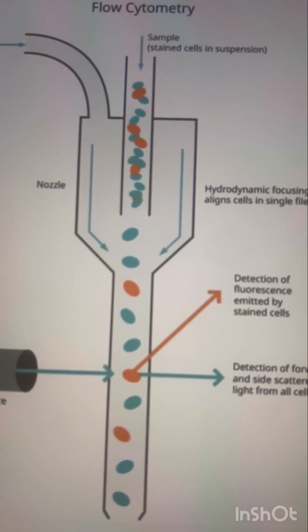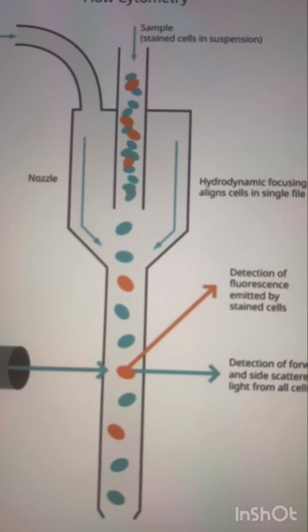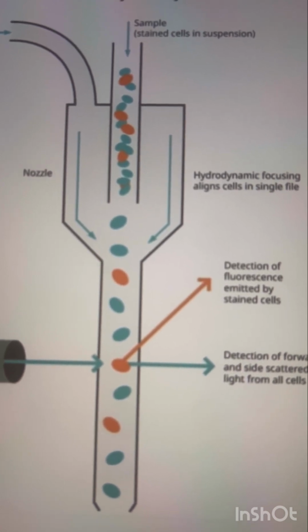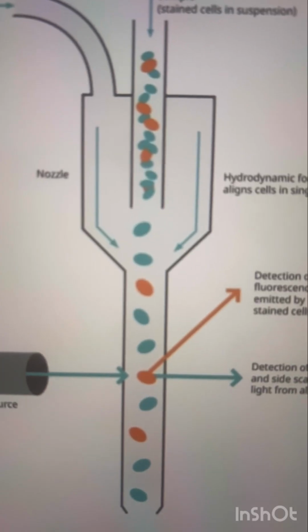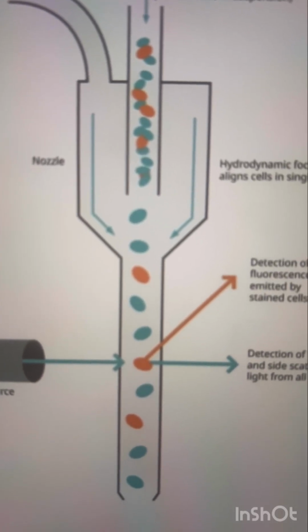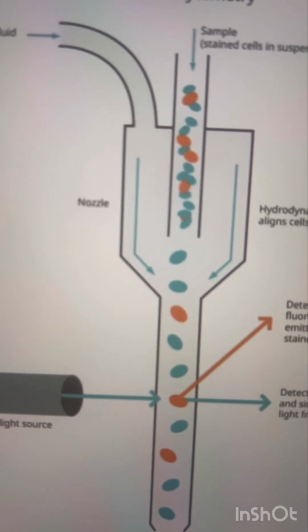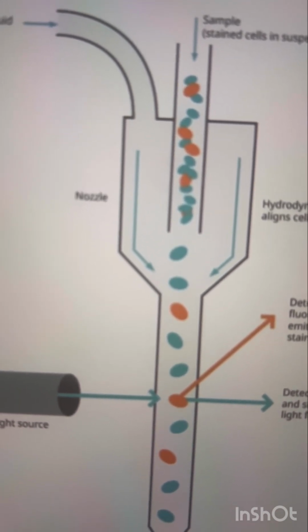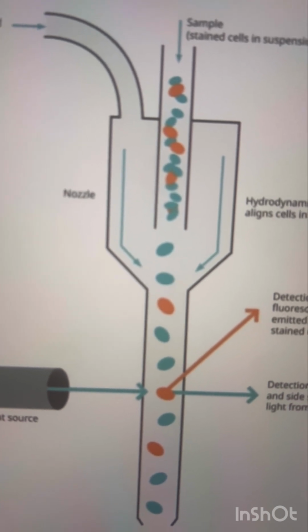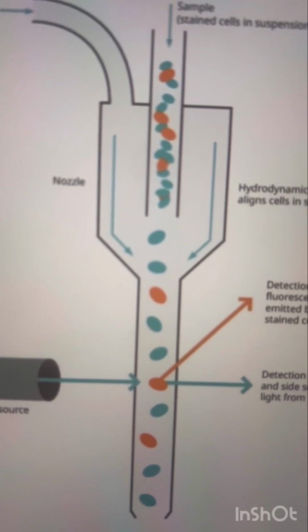For optimal optical sensitivity, there should be two flow characteristics. First, when cells get to the laser beam analysis point, they should look like beads spaced out along a string.